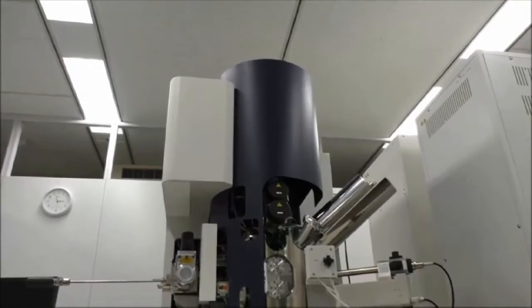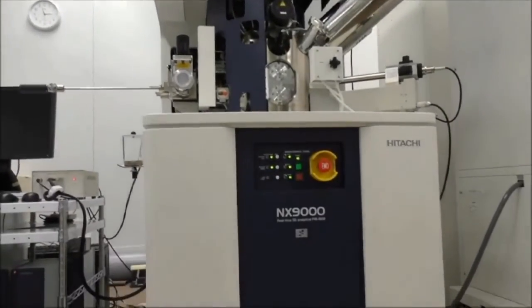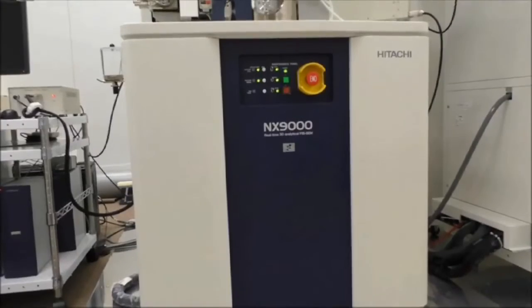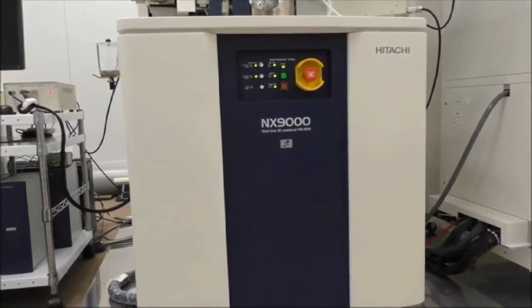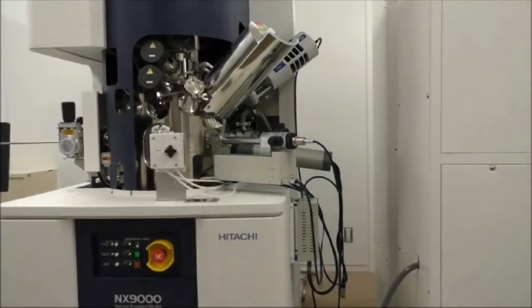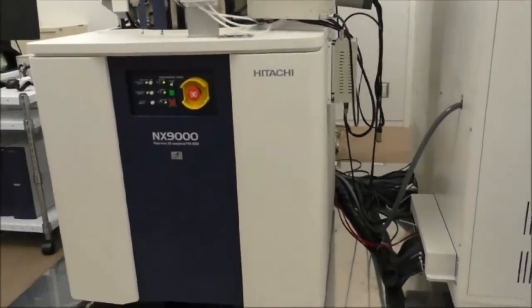Because of the technology we have at Hitachi, we can actually separate these different types of information simultaneously.